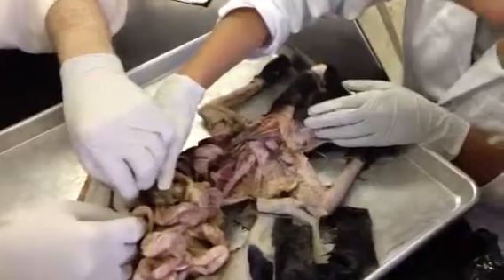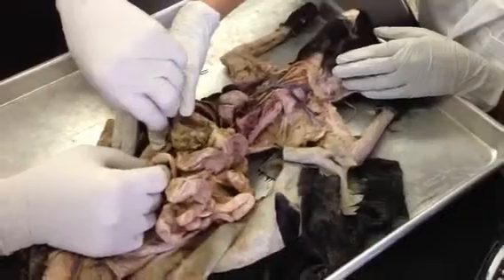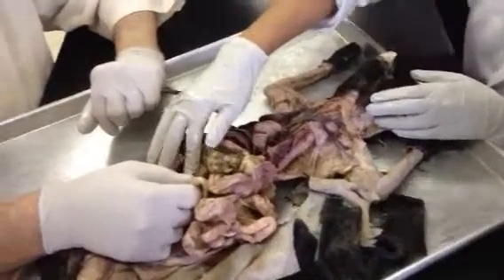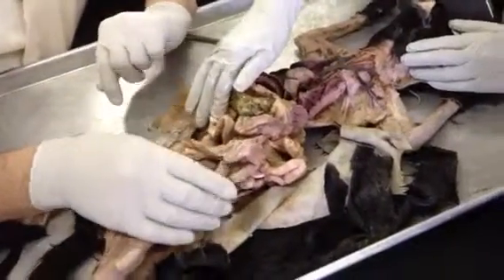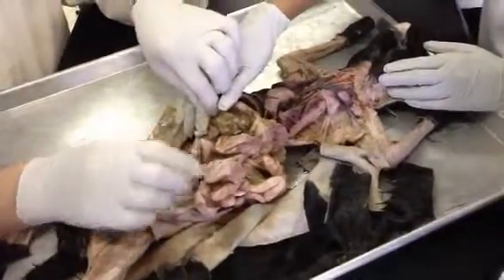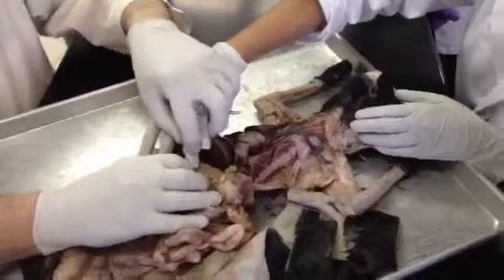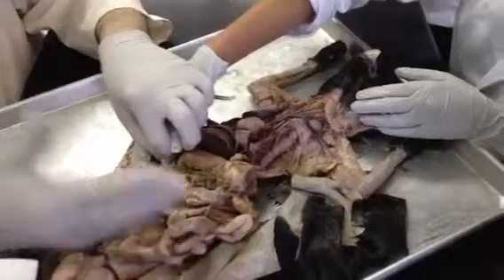Right next to the intestine. It's probably hard to feel where one ends and the other starts, but they're both nested together right there. Pancreas, duodenum. Good? The duodenum connects with the next part of the small intestine, which is the jejunum. What I'll do to have you identify duodenum is show you the stomach, and you'll be able to tell that the duodenum connects to the stomach. There's only one thing that does. It's the duodenum.